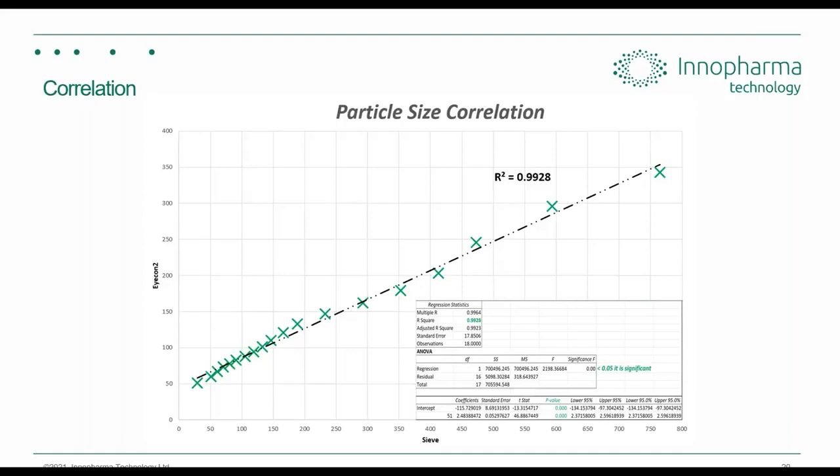So you can assess the level of confidence by calculating your regression value, your R2 as we've seen. And in these two cases, we've seen that it was positive, it was above a 0.9 value. If it was below maybe a 0.5 or even a negative value, you would see that there is no correlation between them. So you would either have to reevaluate your testing method or come to the conclusion that there is no relevance between these two pieces of data that you're trying to compare.